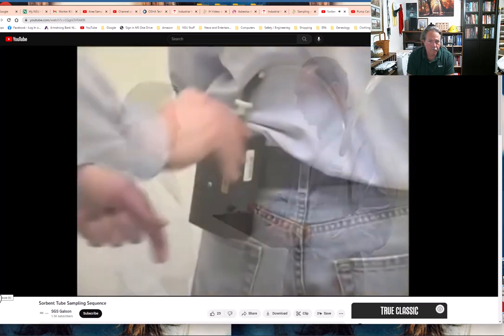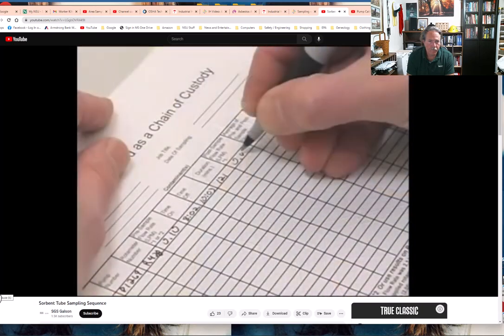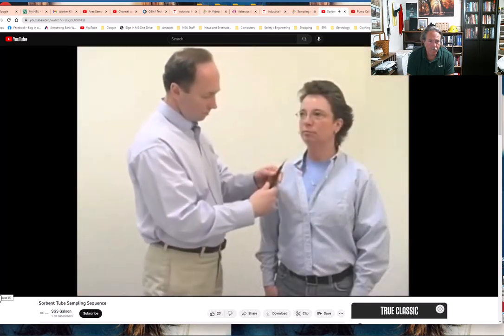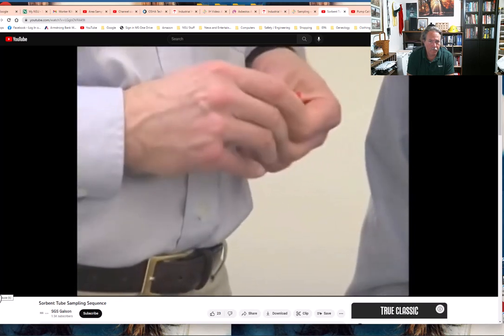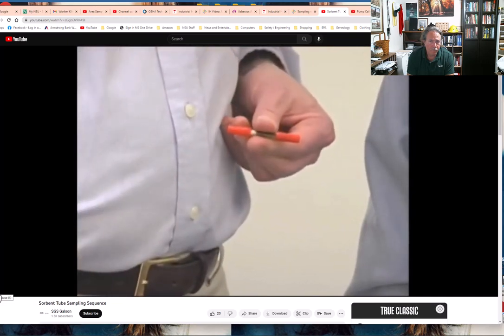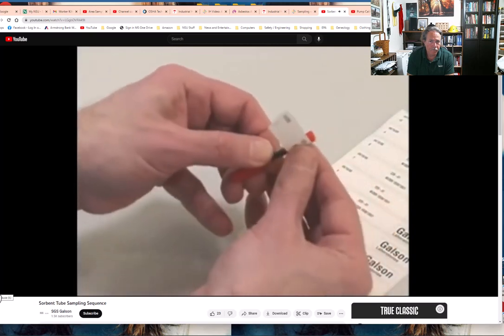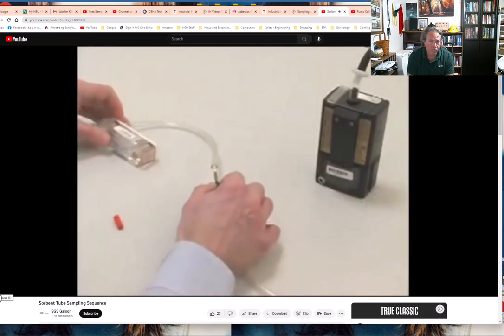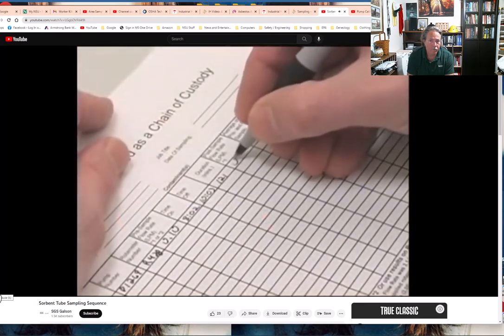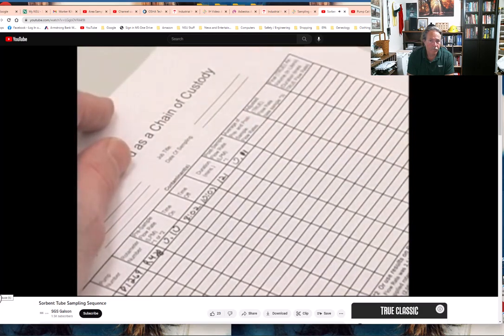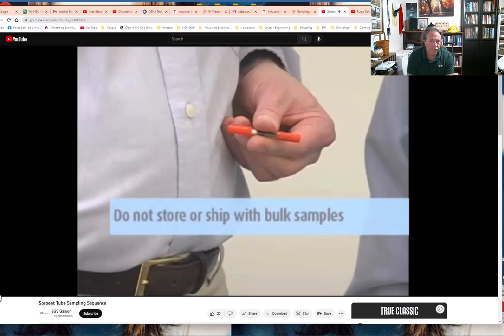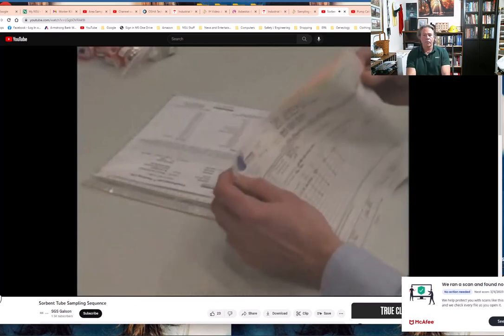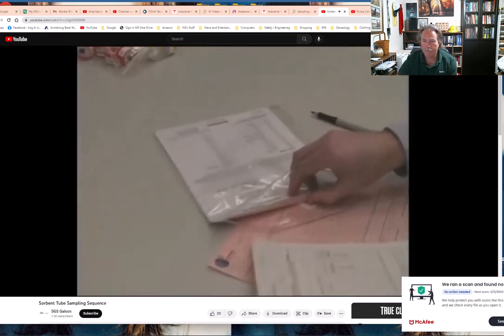After sampling is complete, turn off the pump and record the time. Seal the sorbent tube with the red caps provided and remove the sampling equipment. Label the sample media. Perform a post calibration in an area with approximately the same temperature as used during pre-calibration, then record the flow rate. Follow the sample storage and shipping instructions exactly. Complete the chain of custody form, including all requested information to ensure proper handling and turnaround time.